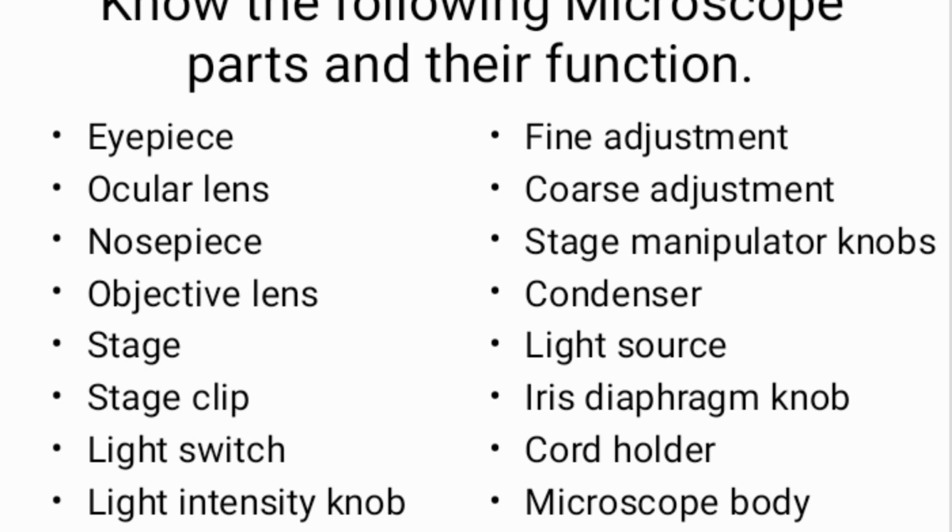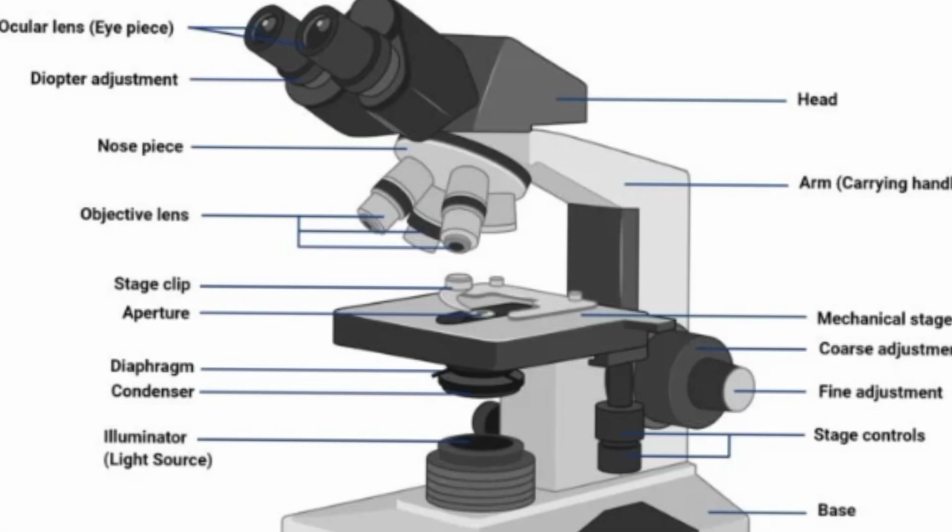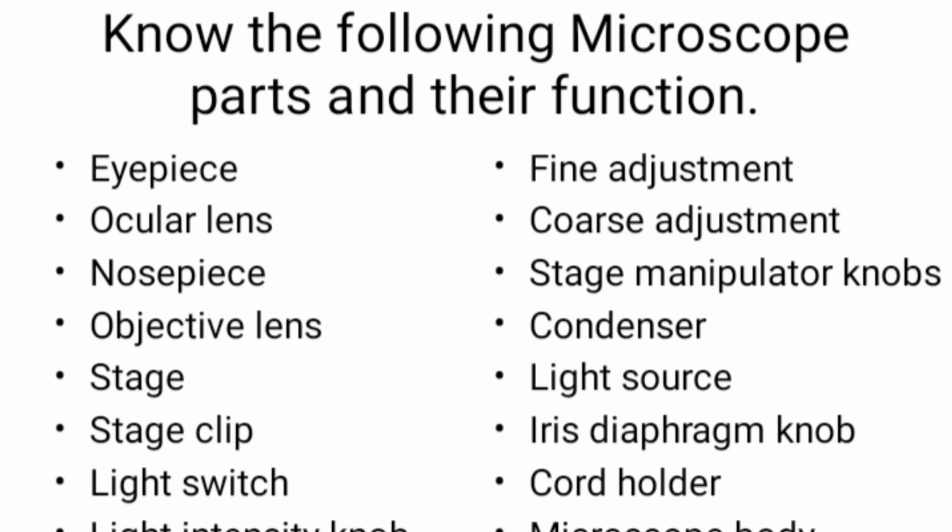But it is very important that you know all these microscope parts and functions. You need them both in your exams and practicals. All right. I'm going to run through them. I will tell you the location and the function of each of these parts of the microscope.